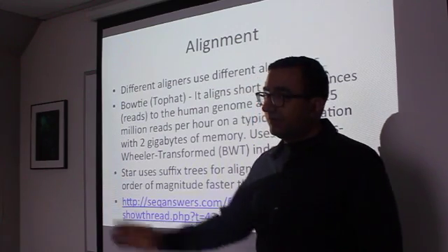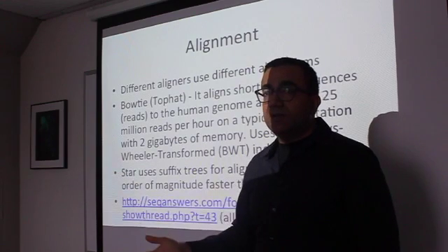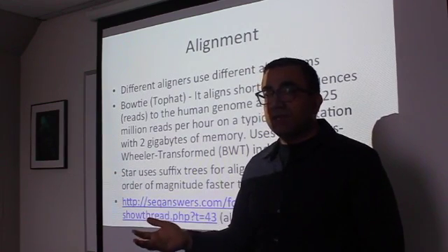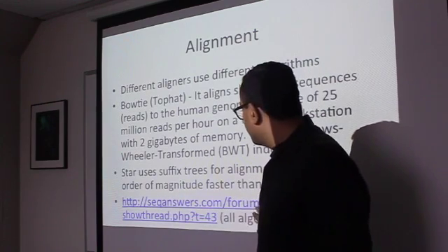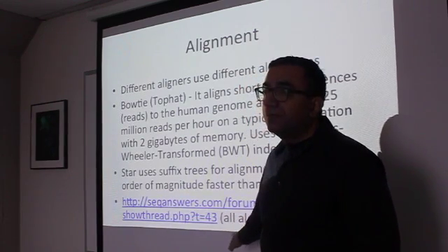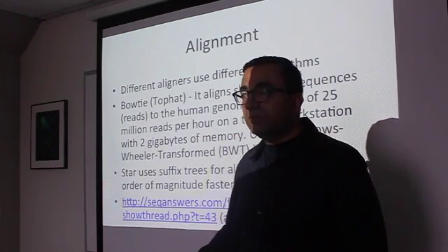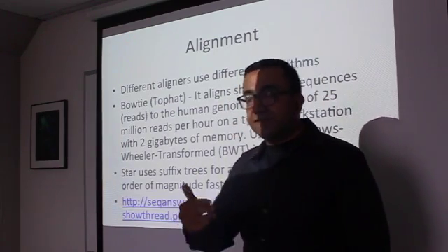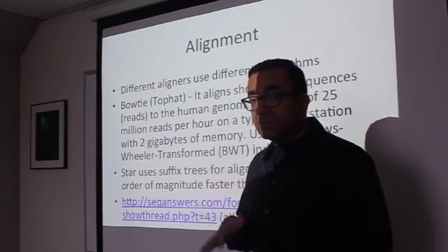Okay, as Mo was saying, you could use both. Some people would use the BWA aligner for SNP calling, which is one aligner some people prefer. So you can go over these forums. That's why I put this link over here. SEQanswers is a good website in general. If you have doubts about these exact questions, you can go and see what the community says. That's exactly what I do.